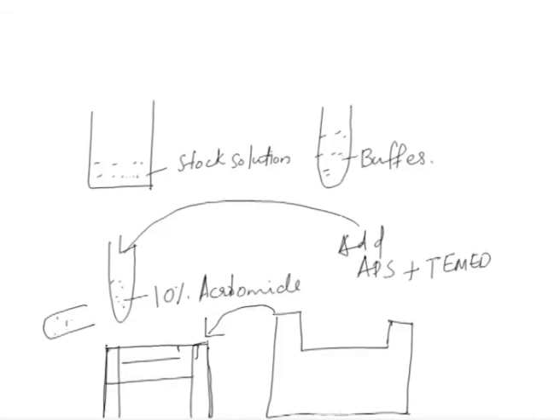Now, what will happen? This material has to be poured in here. So, you will pour your material in here, and you have to be very careful; you will be pouring this through the walls.